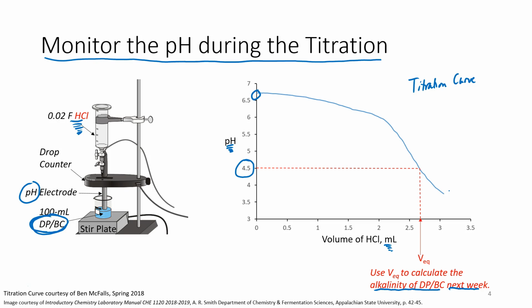Now, if you think about our first titration determining water hardness, we titrated Duck Pond and then we did a QC and that was it. Well, this experiment is slightly different because our titrant HCl is not what we call a primary standard. A primary standard is certified to have some level of known purity, usually greater than 99.9% pure, and HCl isn't that pure. So we have to standardize our HCl.